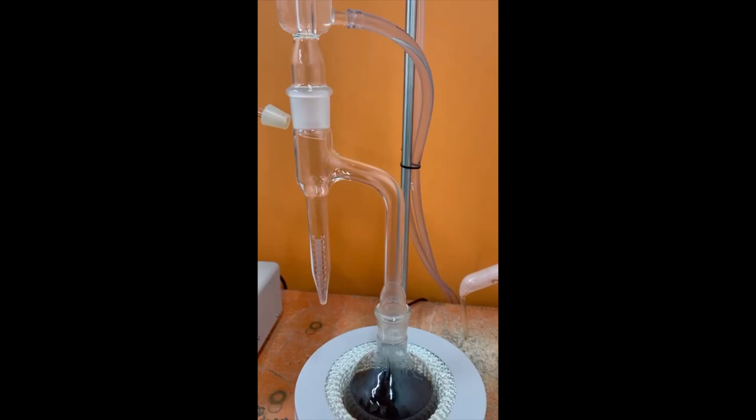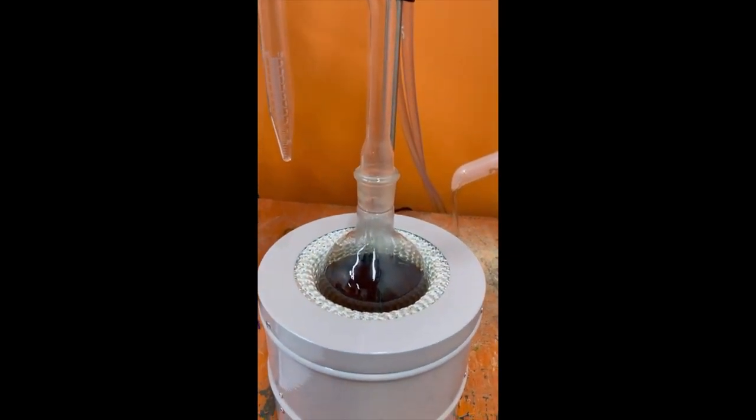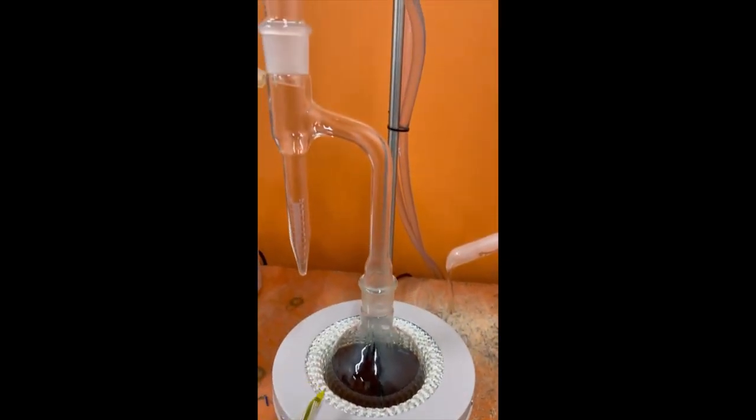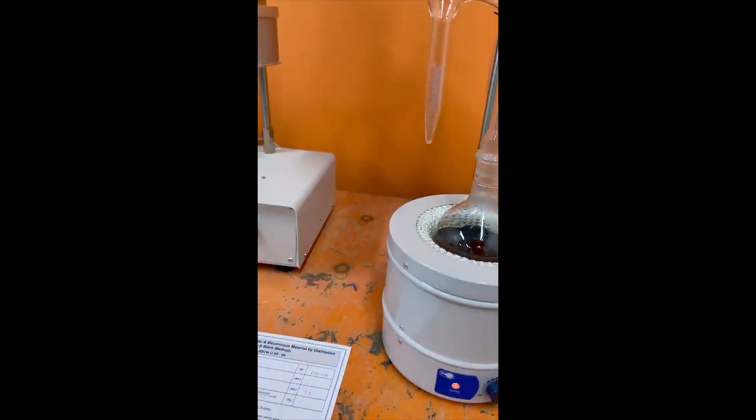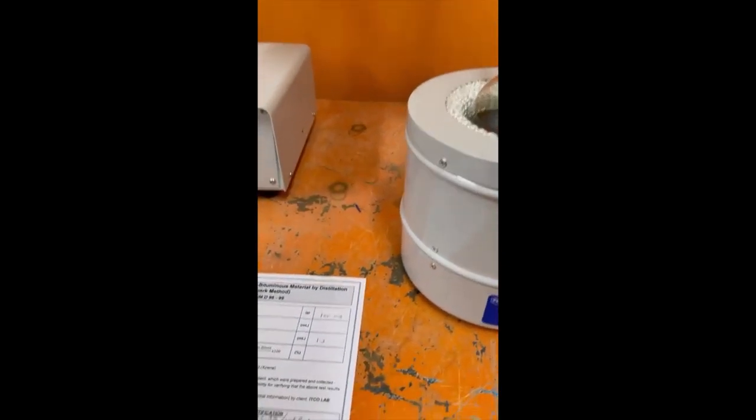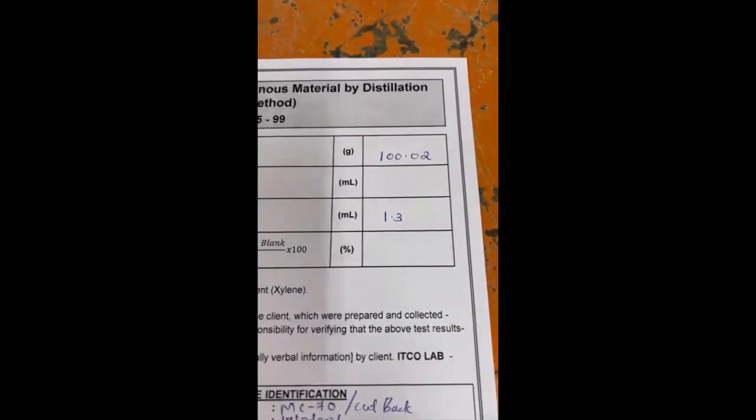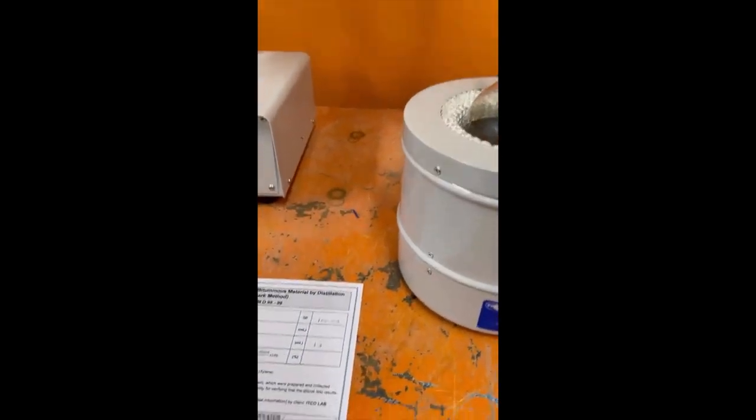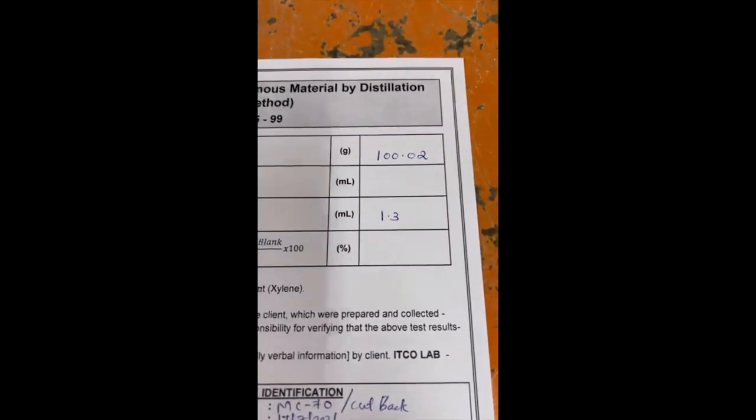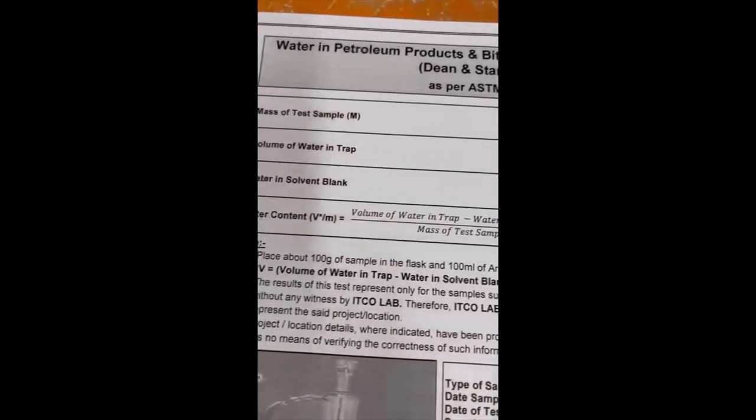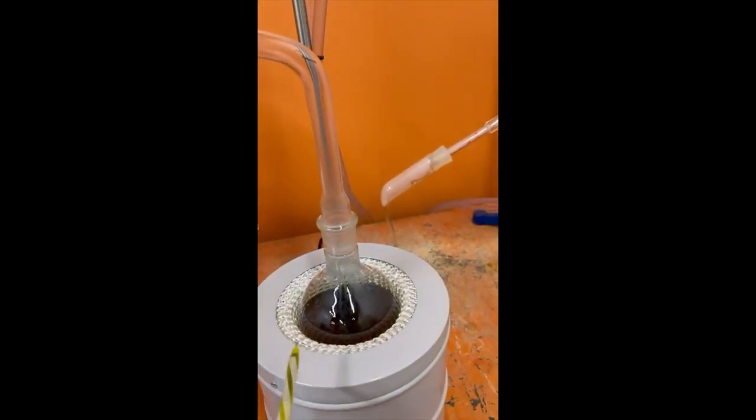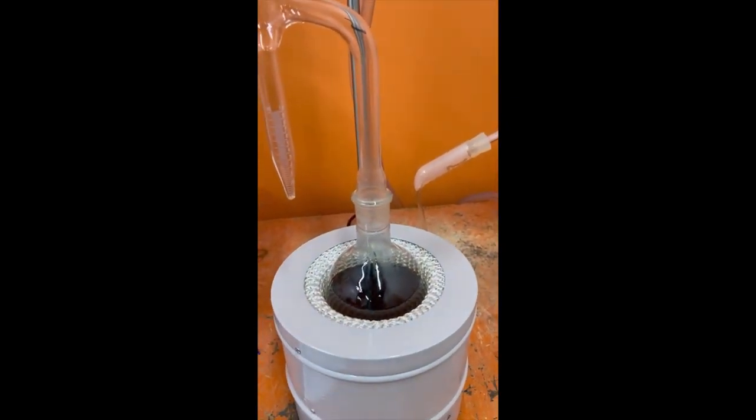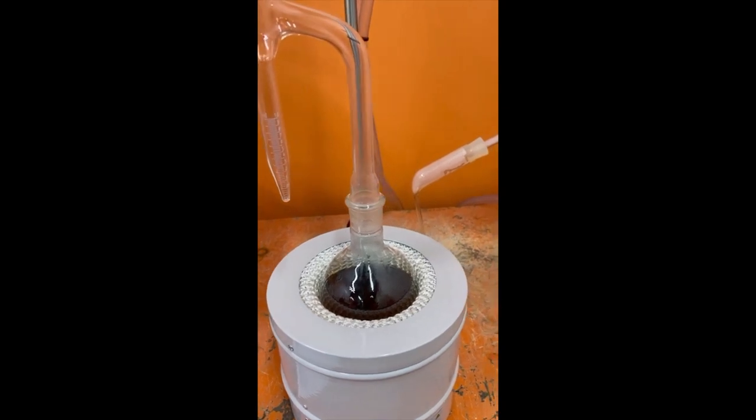Now I took 100 milliliters of bituminous MC-70 bituminous sample and 100 milliliters xylene I added to the cylinder. Now I started heating.